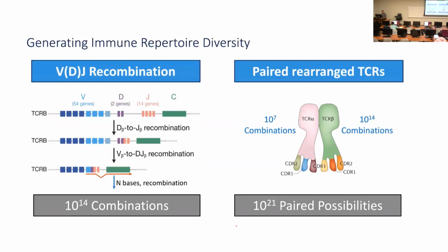So when you have information about the individual cell and what their T cell receptor subtype looks like, you will be able to compare the frequency of different subisoforms of T cells and have some idea what combinations of T cell receptors respond to the infection, to the pathogen.